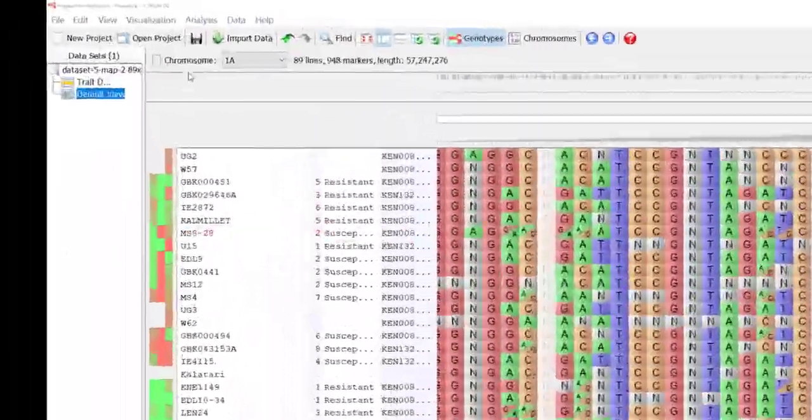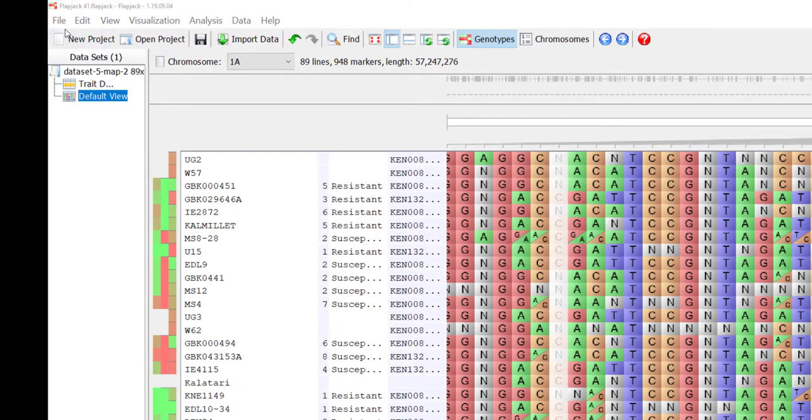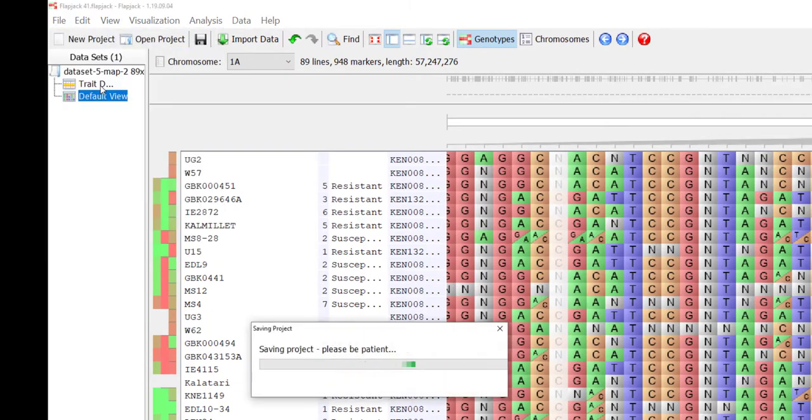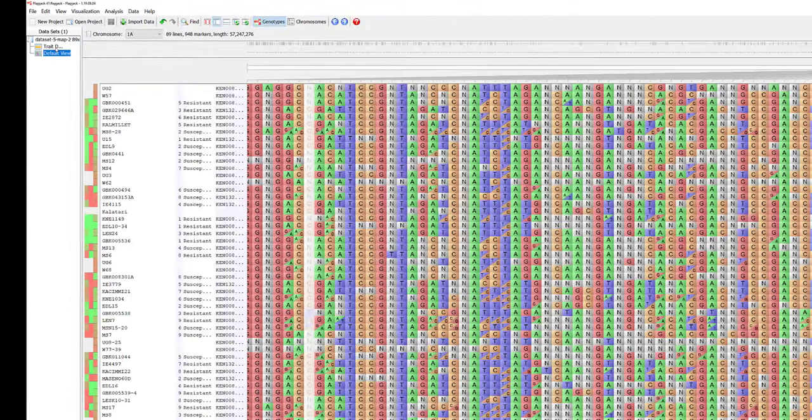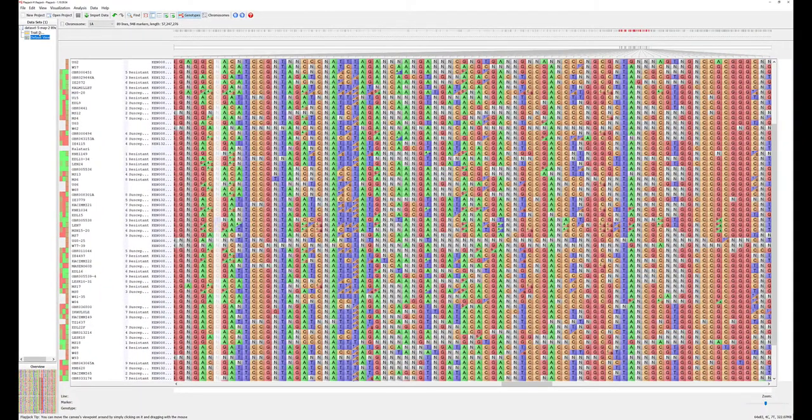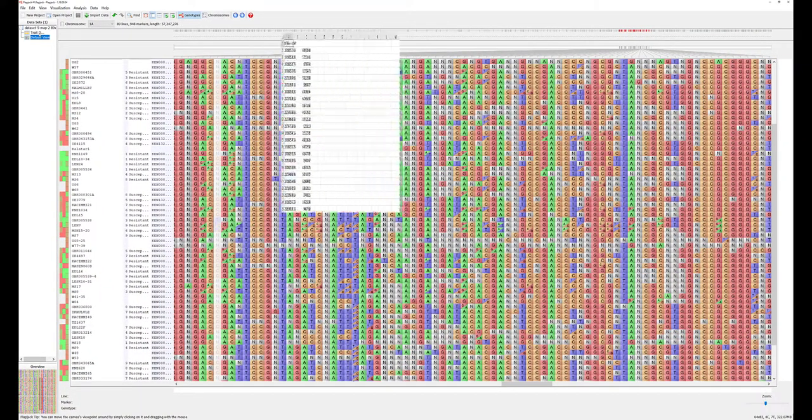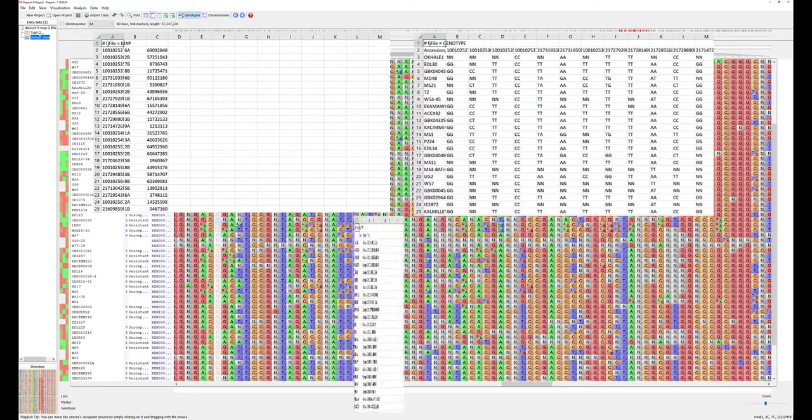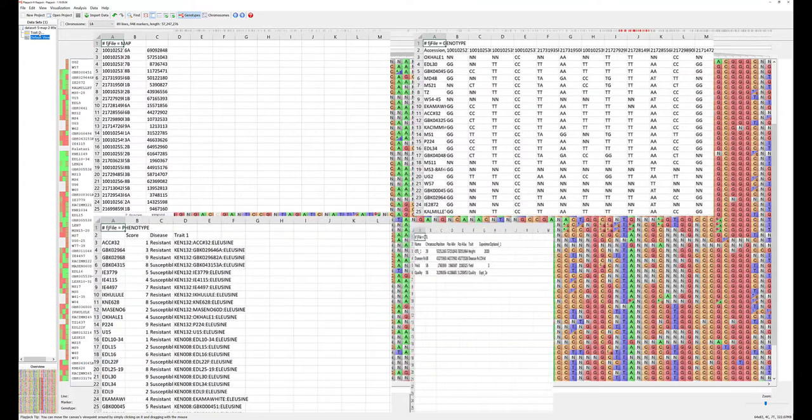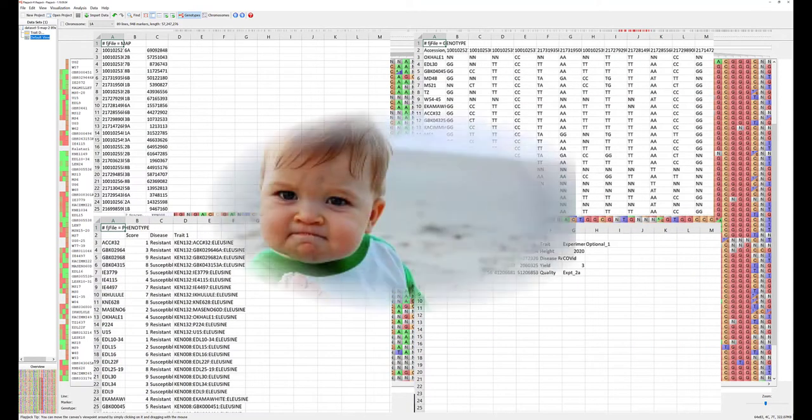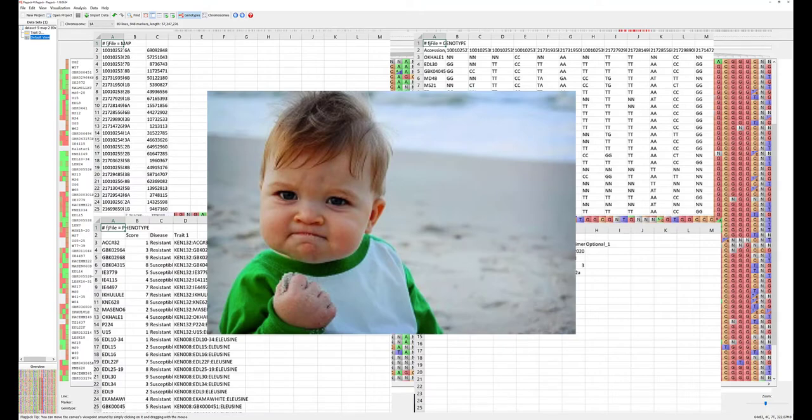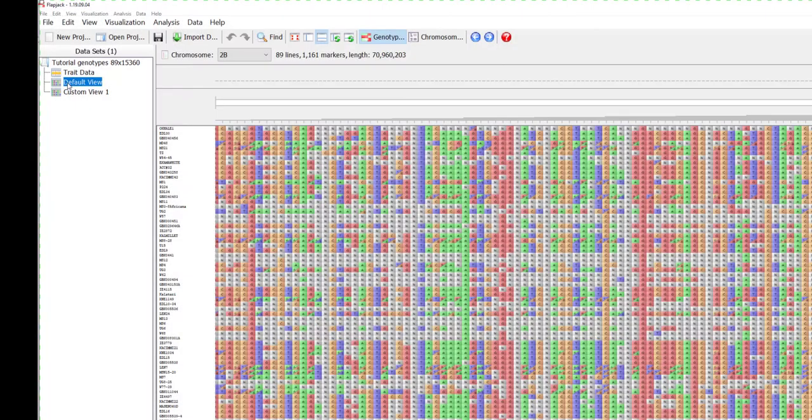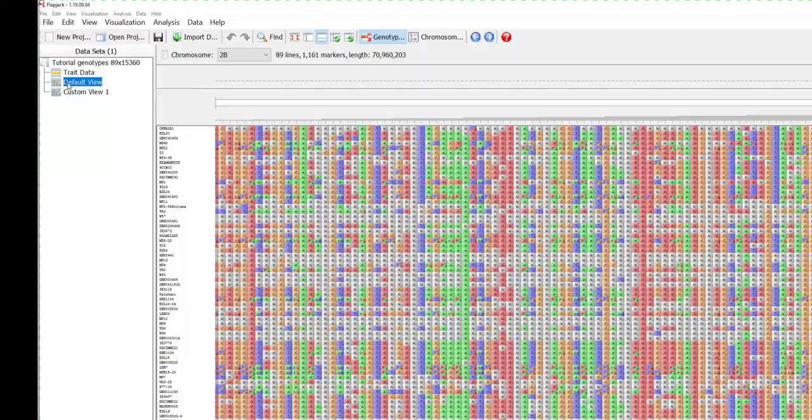Once you have all the information required for your project, select save project. You can now access this project for further analysis at any time. Now we have map, genotype, phenotype and QTL data imported into Flapjack. We can now see how powerful this application is. Please move on to the next tutorial for more information.